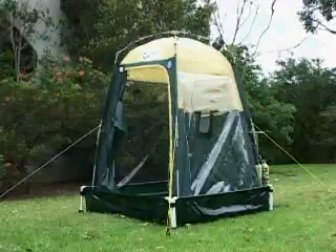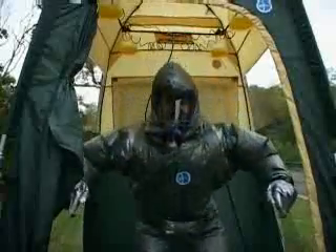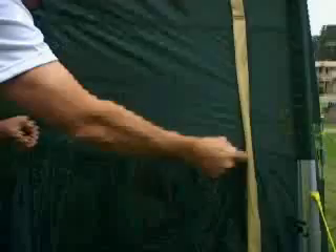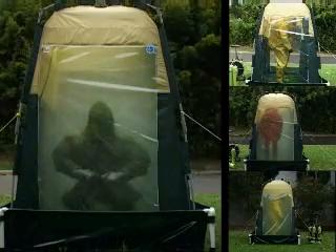In the portable test chamber, an aerosol of fluorescein dye is used as a contaminant. The test routine is the same for all suits. The person enters the chamber and performs a set of exercises designed to encourage leakage into the suit. The chamber is sealed and the contaminant released.